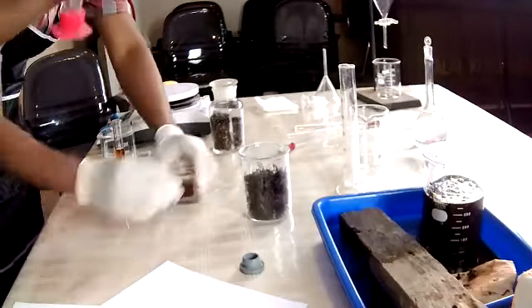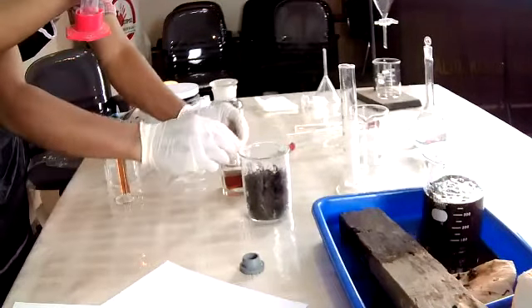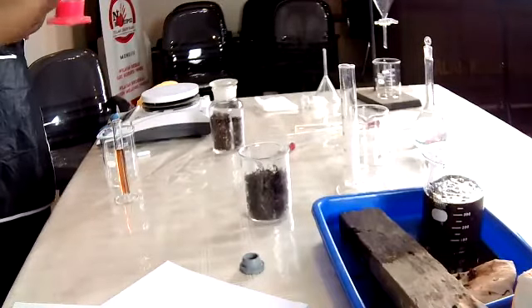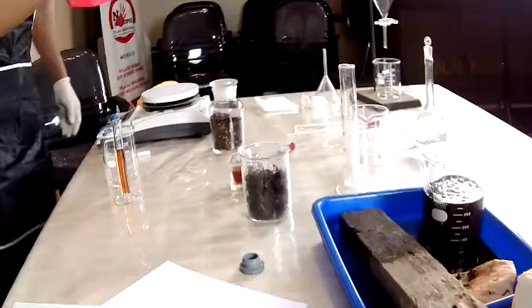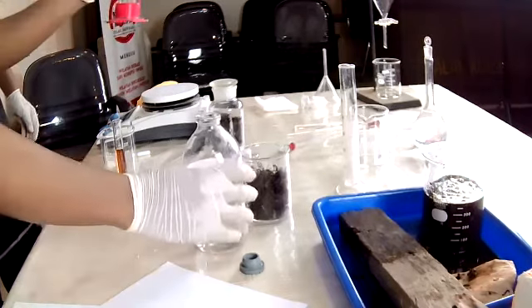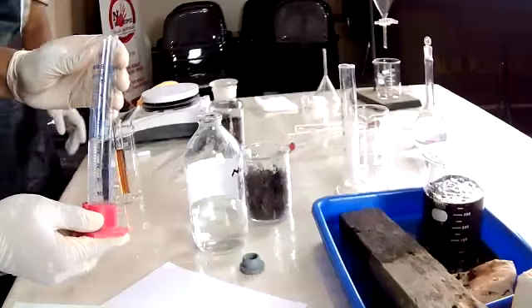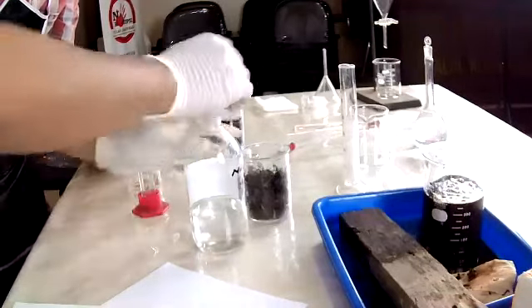We usually use the molar for the units, but we use this percentage just to make it easier for other people. So it's a 4% solution. And then, actually, we're using 30 milliliters.